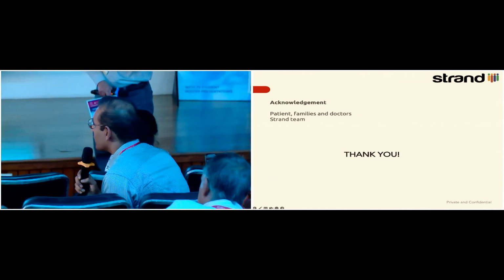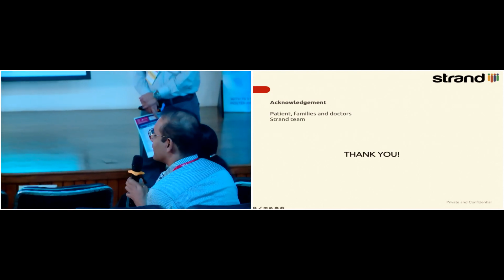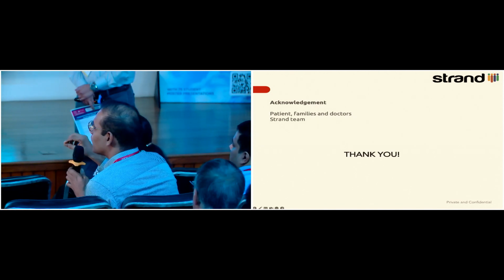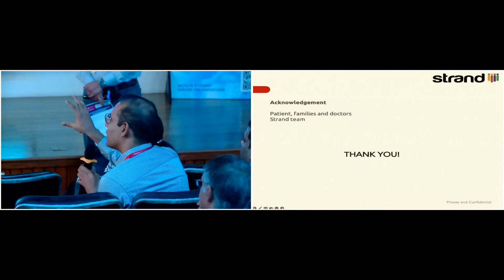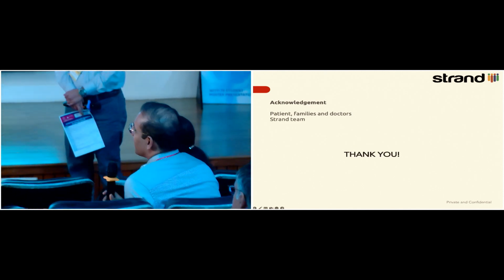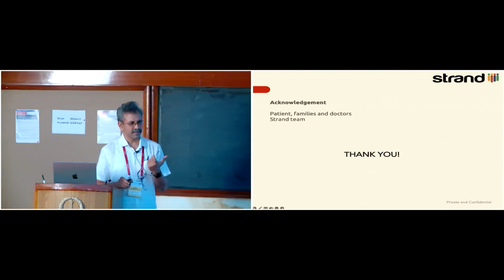Hi, very interesting talk. Since this is a computational kind of gathering, and you showed various ideas that have already been explored, if you had to pick something, what's the biggest challenge that you still face in copy number variant calling, and what could we still work on which would make a difference to what you're doing right now? So copy number calling is all about the size of the event and the accuracy.